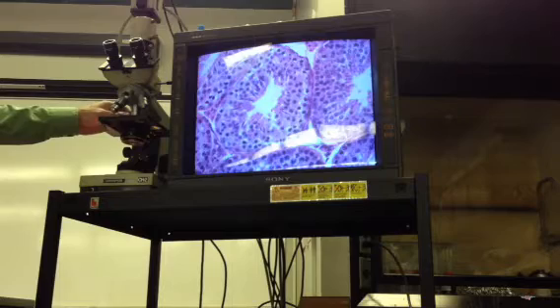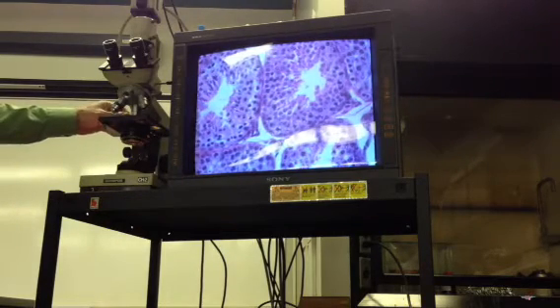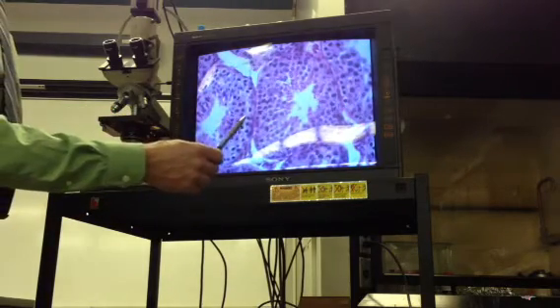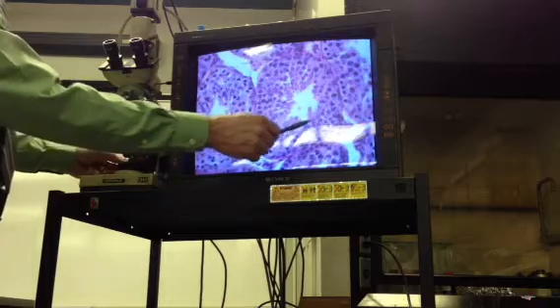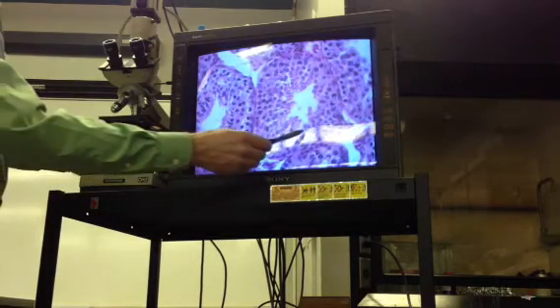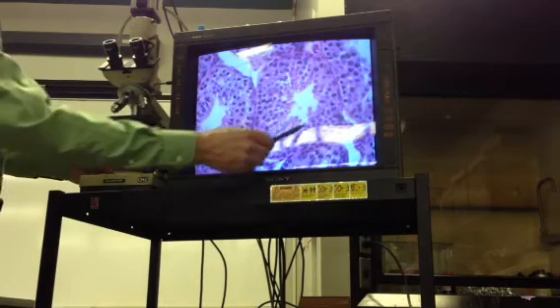Because the spermatic wave is variously going on in different sections of the tubules, we look at one next door and we can see, for example, that there are a lot of spermatogonia and primary spermatocytes. Spermatogonia are small and they have some staining material.